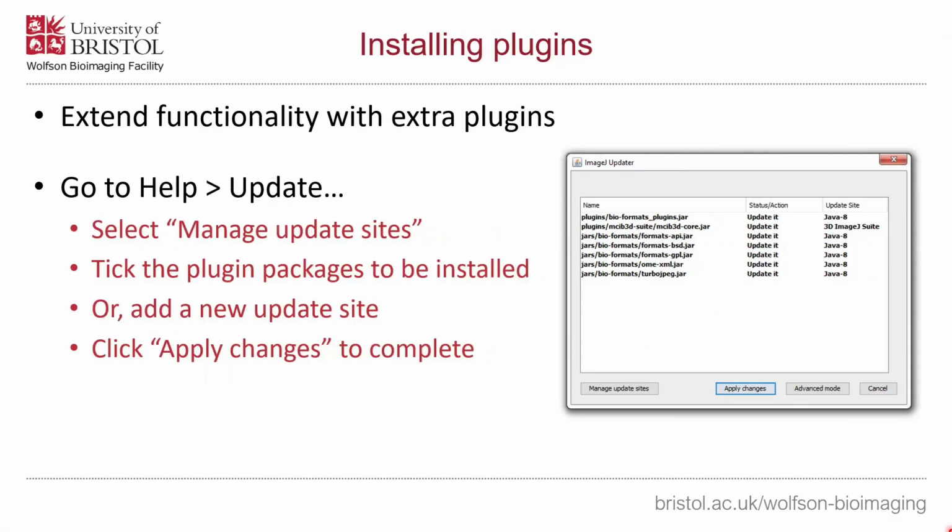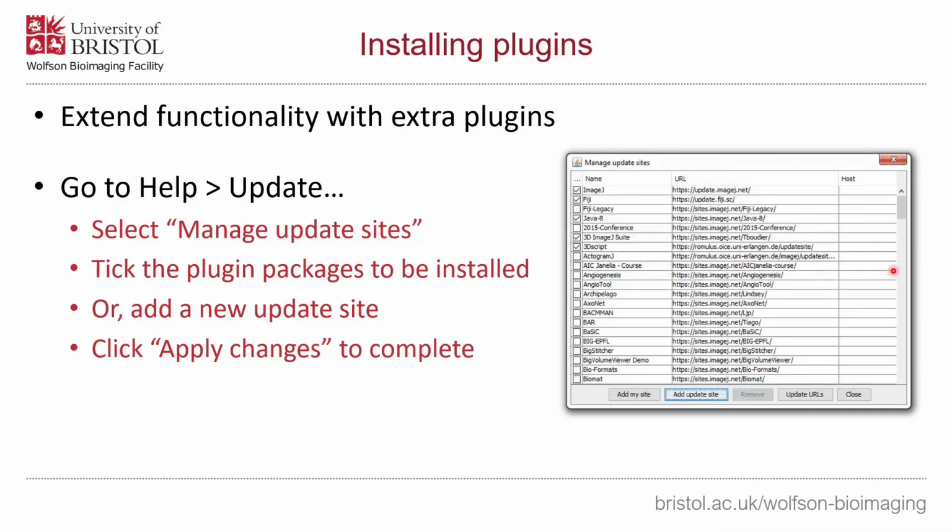So before we wrap everything up, I just wanted to go through a couple of extra features of ImageJ and Fiji. First of these is the ability to install plugins. You can do this by just dropping jar files into the plugins directory of your Fiji installation. However, it also has this package manager. You can get to it by going to Help and Update, and then if you click on Manage Update Sites here, you'll get shown this window, and this is just a list of all the available plugins which come semi-bundled with ImageJ, or with Fiji.